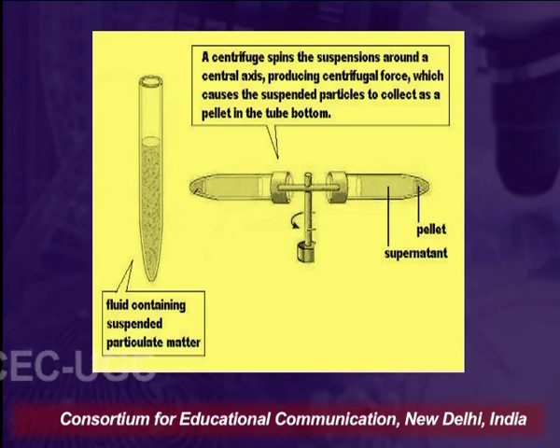In any extraction we are doing, for example of DNA from any biological material, we must know at which step we are looking for what kind of cells in the pellet or supernatant. Is the supernatant of our use, or is the pellet of our use? So we have to take care depending upon the sedimentation rates of the different particle sizes which we are looking for.